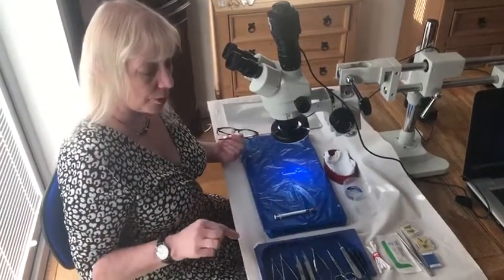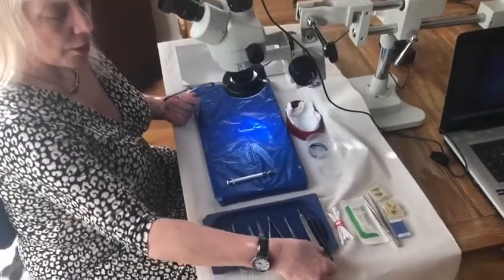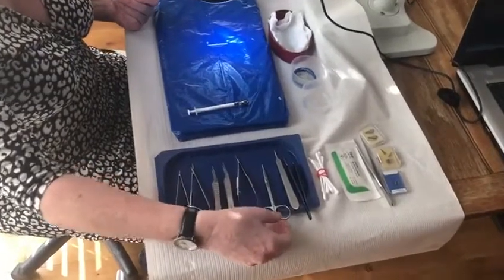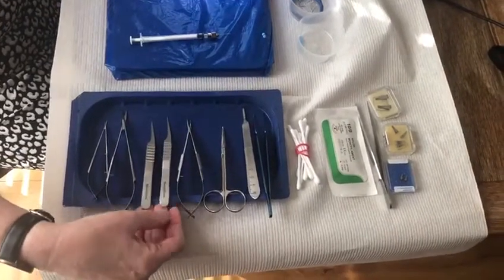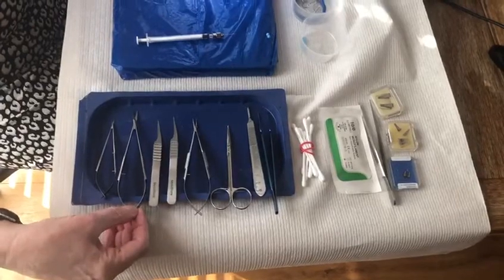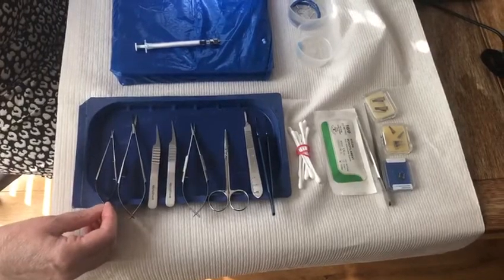Then we come to your actual instruments. What we've got here is a toothed forcep, your scalpel handle, a pair of basic scissors, a pair of needle holders, two pairs of forceps, a pair of micro scissors, and then we've got a tiny little pair of Vannas scissors for really small micro work when you get down to super microsurgery levels.